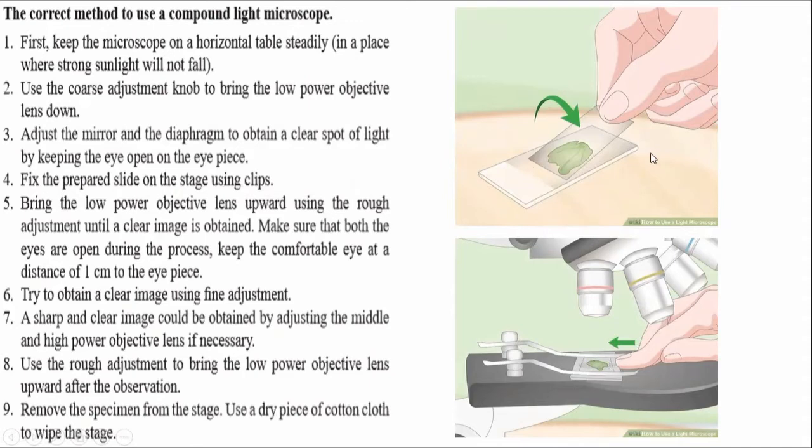All right, I will teach you how to prepare a microscopic slide in the next slides, in the upcoming slides. For the moment, just remember that you make the slide and then you fix it on the stage. Okay.